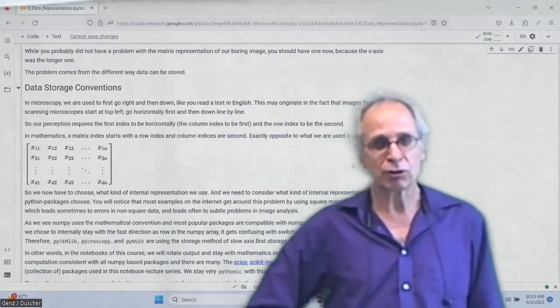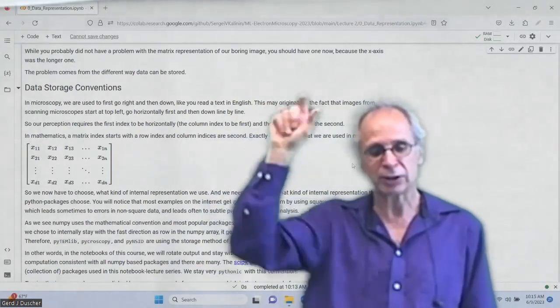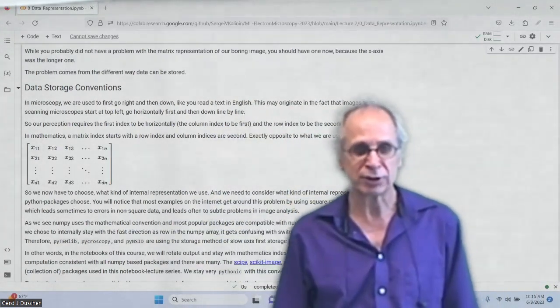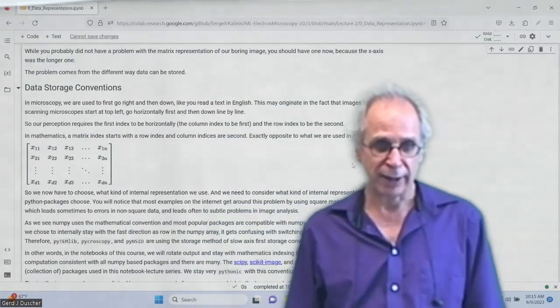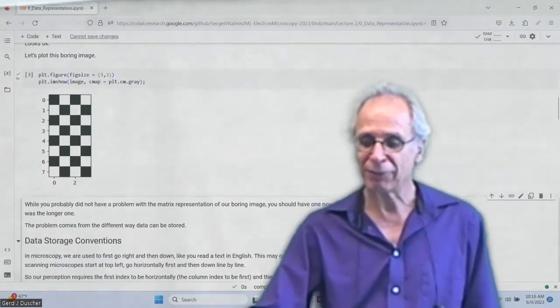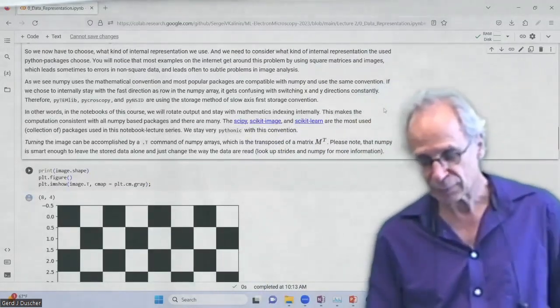So there are 3 orders of magnitude difference in the time scale between pixels on top of each other versus left and right. Any kind of instability will, of course, be important. Most images are square, so it's not easy to determine whether you have a problem with your scan or not.